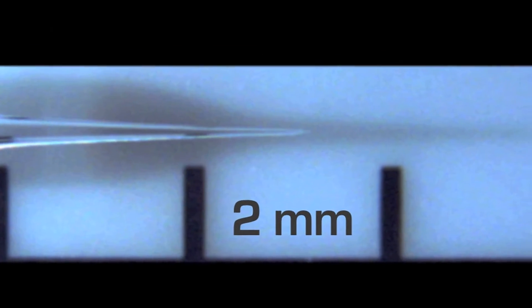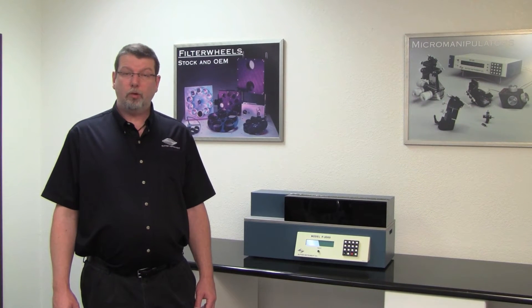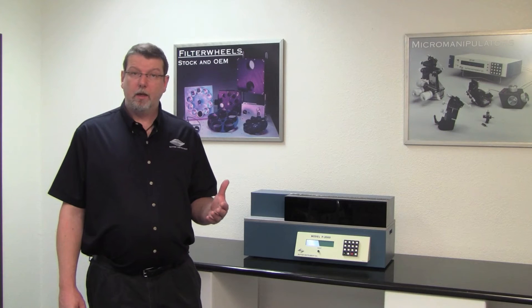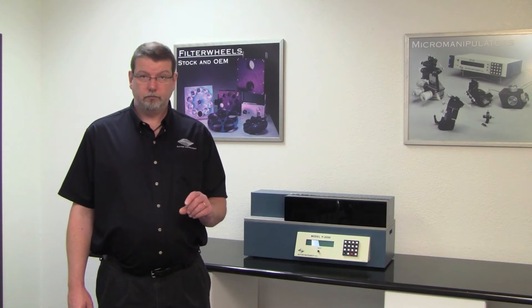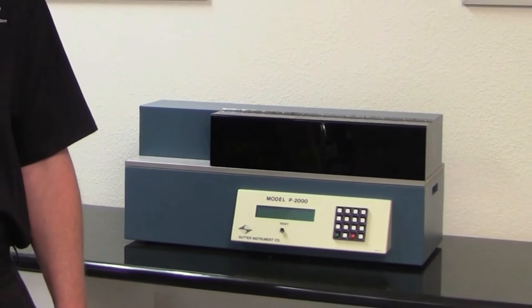Our ultimate goal is to give you an in-depth understanding of how each of the parameters affects the geometry of the pipette and what you need to change if you want to achieve, say, a shorter taper or a smaller electrode opening. This introductory video will give you a little general background about the P2000 puller and will help us understand what we see in those close-up videos.